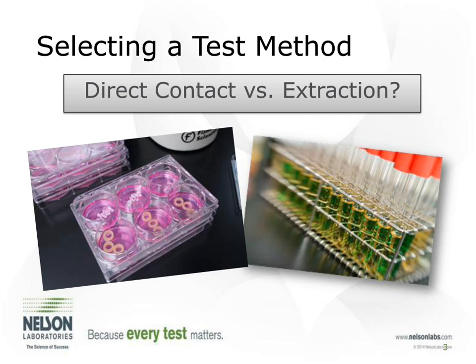And so these are the two methods that we have for medical device testing for these big three. When you're trying to determine what test method works best for a device, really it goes to clinical use, or trying to make it the most representative of the clinical situation. So for a direct contact test, the most clinically representative contact would be intact skin. So the most common devices that we use for this type of test method are gloves and gowns and masks, things along those lines. Really, for anything else that contacts body fluid, we use the extraction method, where we put that device into the fluid.